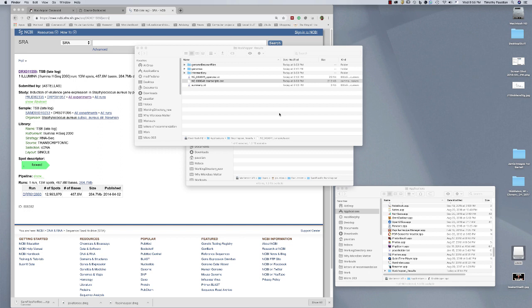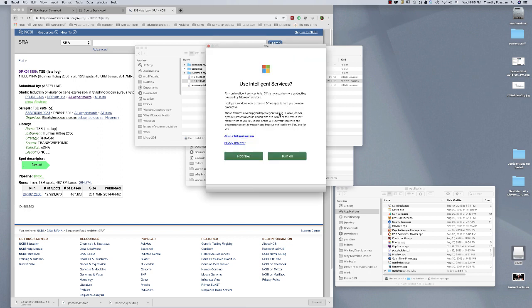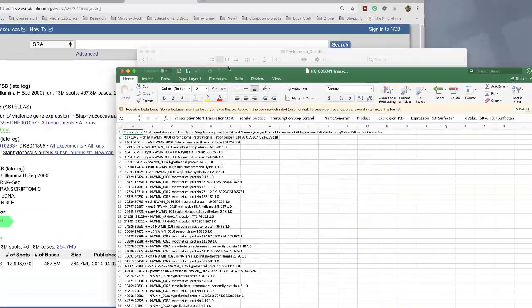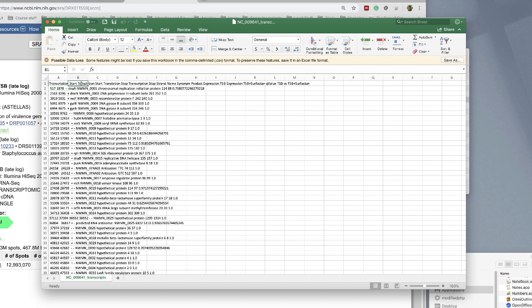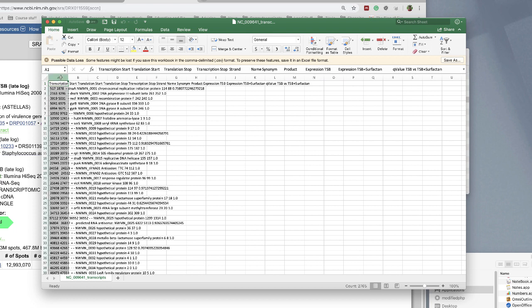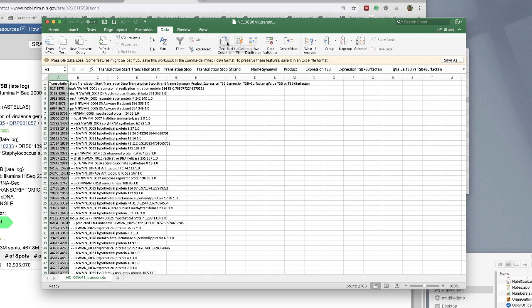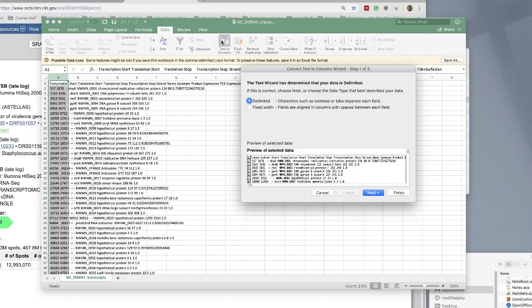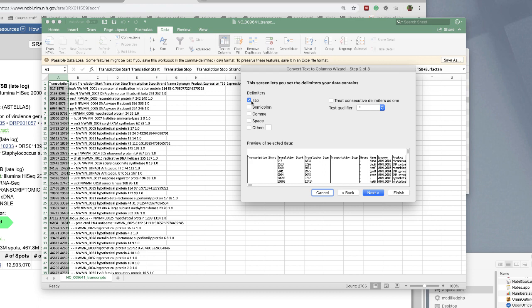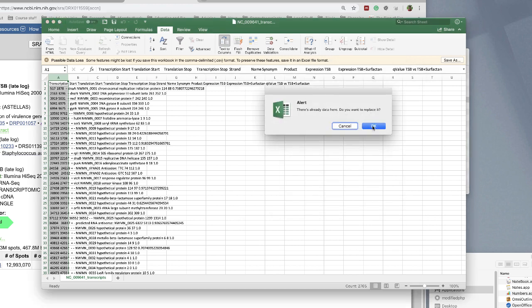Now what we're going to do is compare the expression between the two and see which ones go up under virulence conditions. The data comes up — you'll notice all the data came in the first cell and nothing in the second cell. This is a tab-delimited file, so there are tabs between each thing. We need to map that into columns based on tabs. Click on column A to select the whole column, then go to Data and you'll see Text to Columns in Excel. Click on that, say it's a delimited file, go Next, say it's only tabs, and you'll see how it's going to space it out. This looks fine, then say Next and Finish.